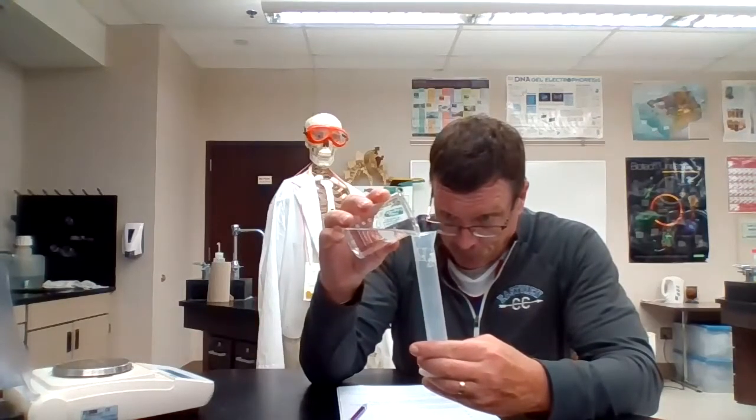All right, let's add another 10. Get ourselves up to 20. That worked well. 36.93 grams.